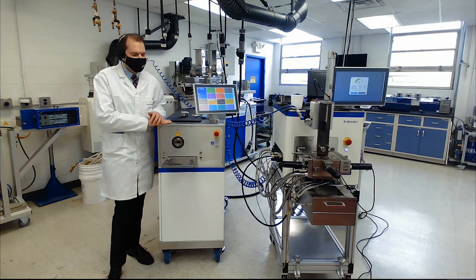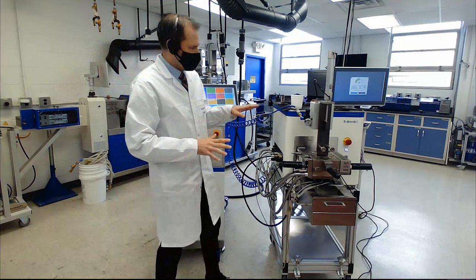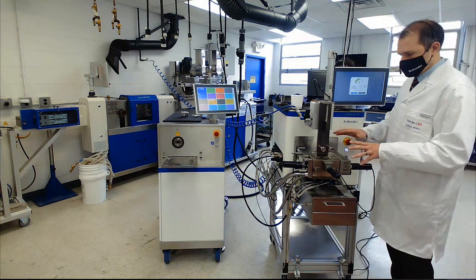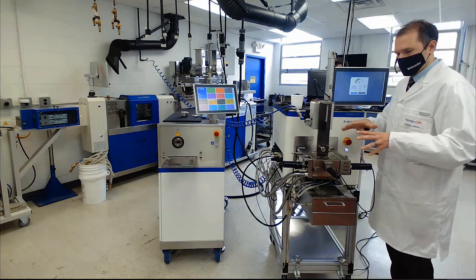The mixing measuring head that we use here in our setup is our three-piece mixer of the international design. This has a couple of safety features that might be new, but don't worry, the mixer itself is completely exchangeable. The drive can handle any mixer that you might have as legacy equipment because the mounting pattern is always the same.